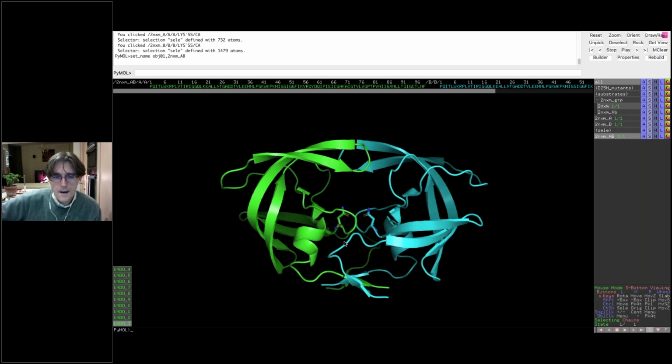Yeah, sure. I think the example with the cytochrome P450 highlighted it quite well. Let me just see if I've got any other quick examples I might be able to load. Let's see.